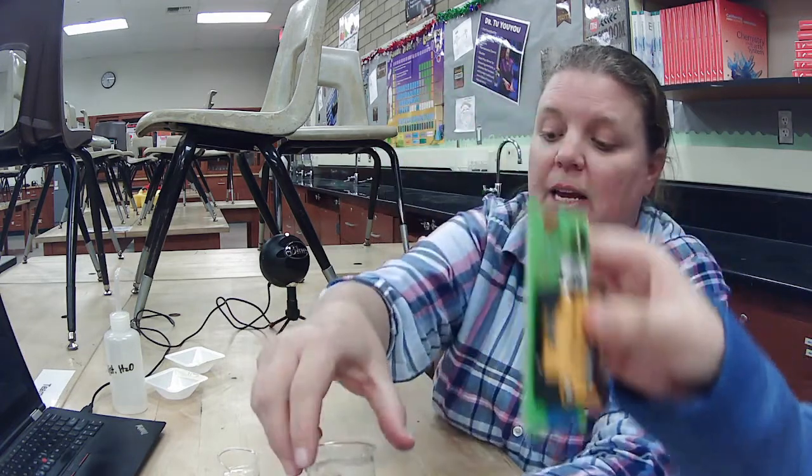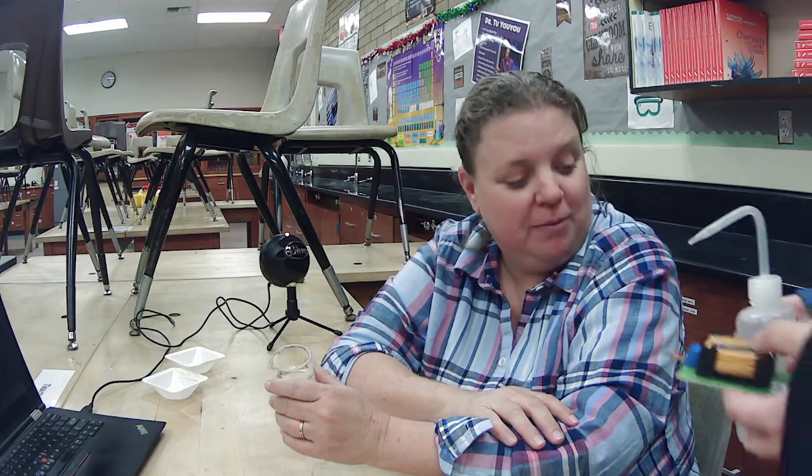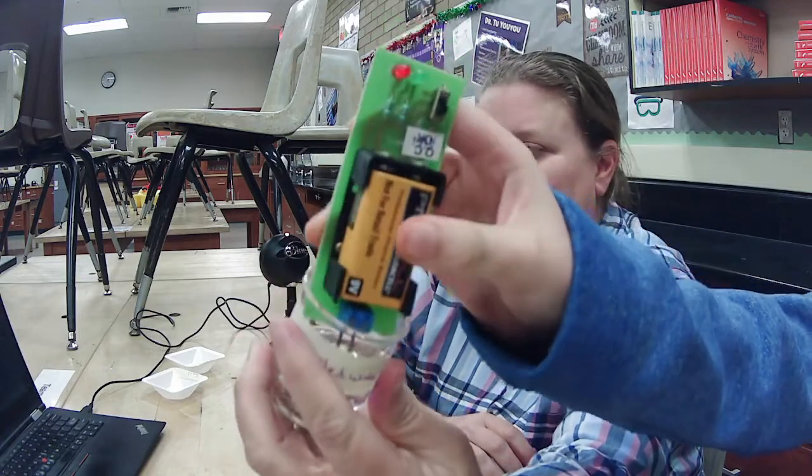Between each one, Josie's probably going to kill me, but she's got to get up and go rinse it between each one, because we don't want to contaminate the tap water as we go forward. So that was tap water. Now we're going to use distilled water. Distilled water is boiled, and then most impurities or things that are not water are left behind. There are some, but most of it is gone. This is distilled water, and Josie's going to do that one.